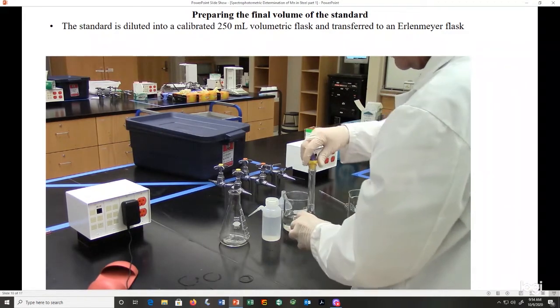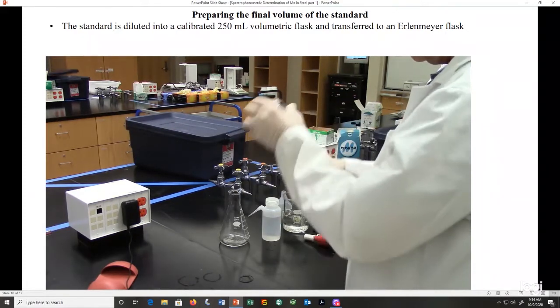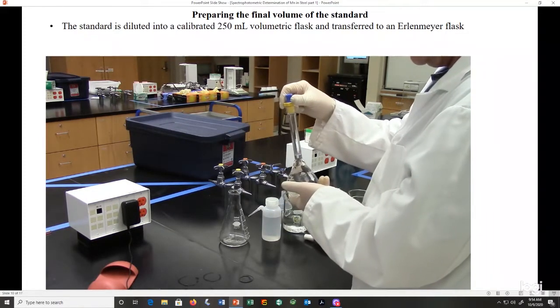And finally, we're going to want to invert this flask several times to make sure that our mixing is complete and uniform.